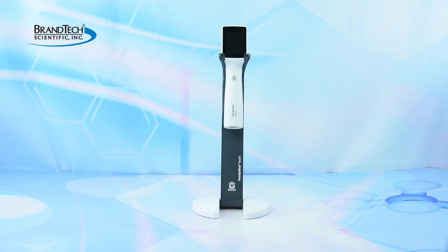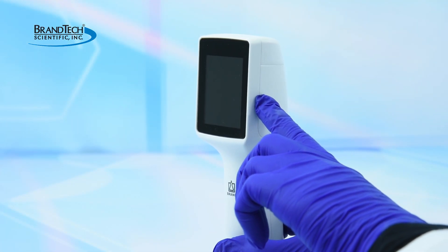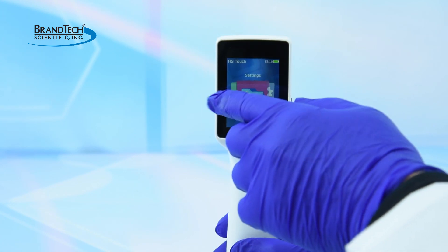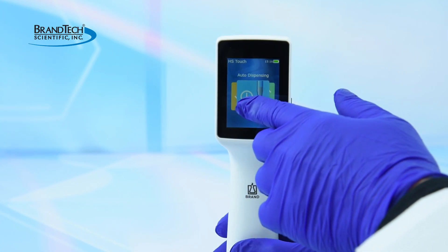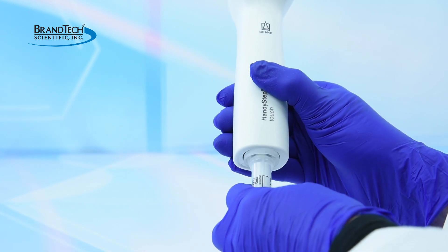The battery should be charged before use. Press the power button located to the right of the screen. Swipe left or right until the desired mode is displayed, then tap to confirm.